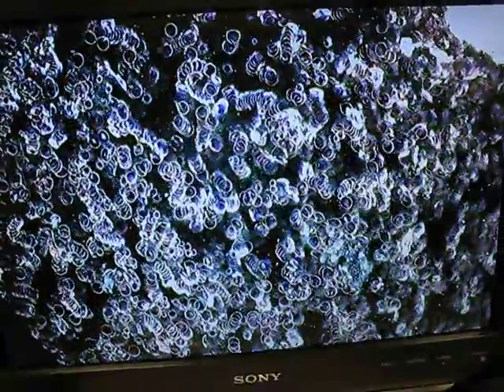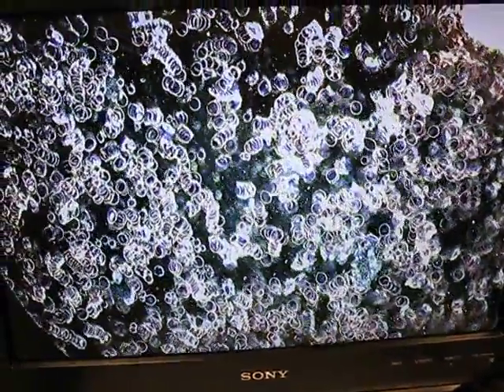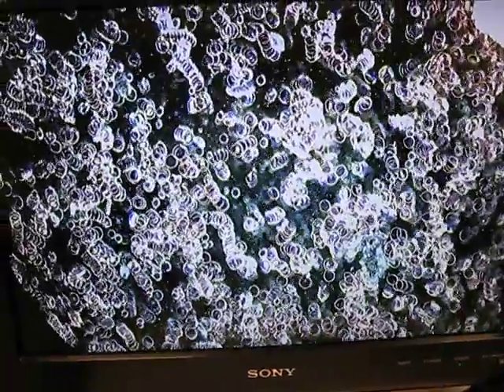The highest position is actually really washed out. If it's too close to the top, you start to see this. So I back it up. The ideal place is somewhere in between — right there. Yeah, that's the ideal spot.